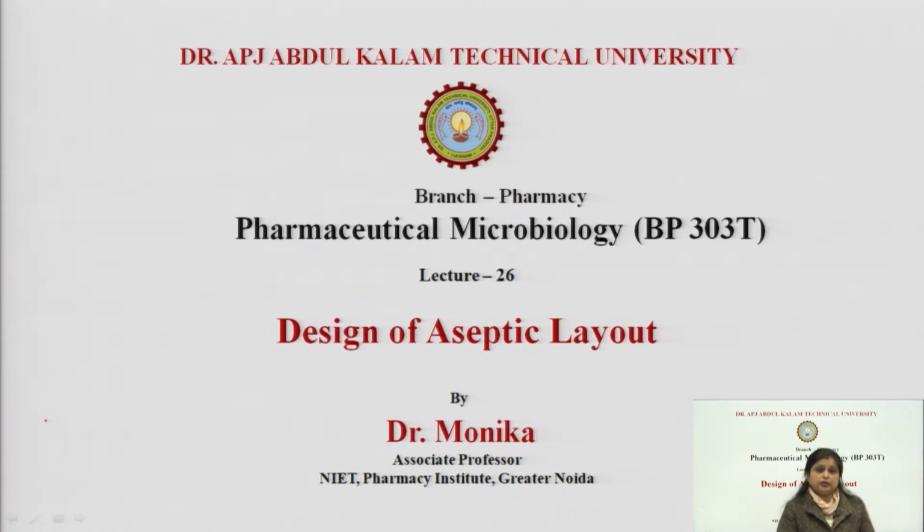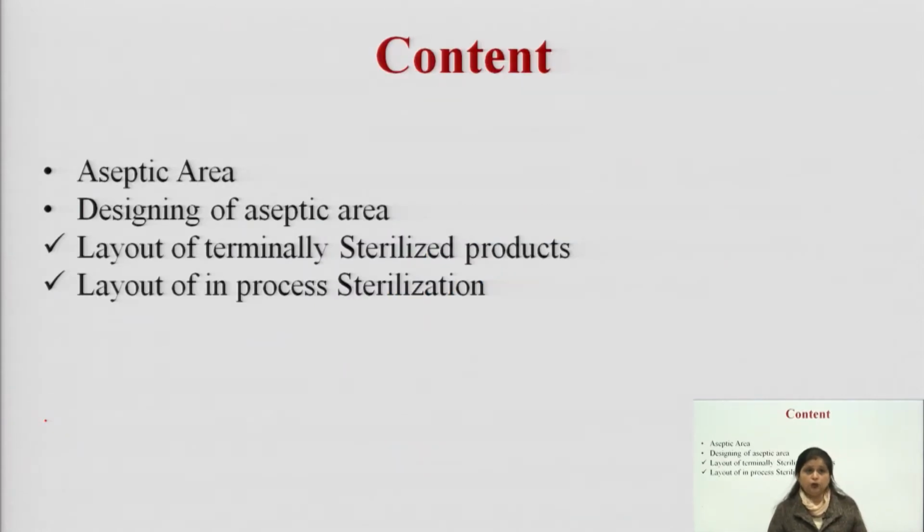I am going to take module 1, and in this lecture I will mainly focus on the aseptic area. What we actually mean by aseptic area, and how we can design the layout of an aseptic area based on terminal sterilized products as well as in-process sterilization. These 4 things we need to cover in this lecture.